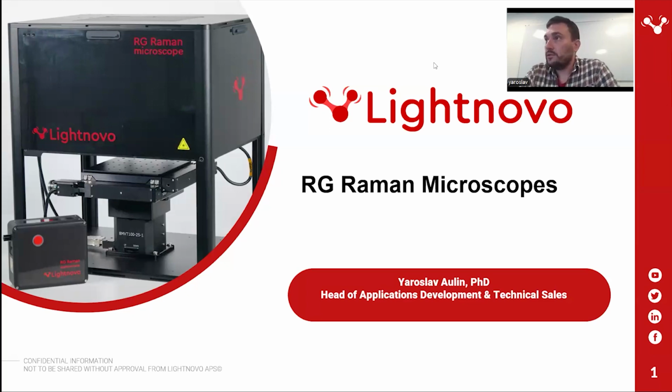If you use a standard RG spectrometer, it's probably starting from a few milliwatts, but we also have the RG spectrometer called LPR, large power range, where the power is tunable by a polarizer. There you can go to very low powers, below 0.1 milliwatts, so that even for very sensitive samples, you won't be damaging them. However, going to very low powers, you would need to do the mapping longer.